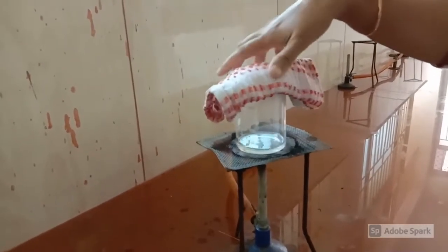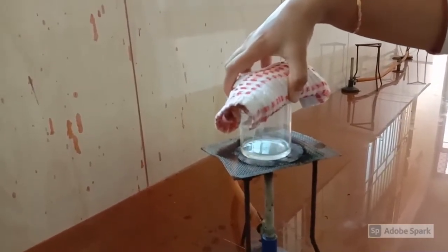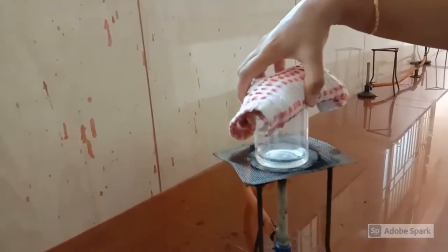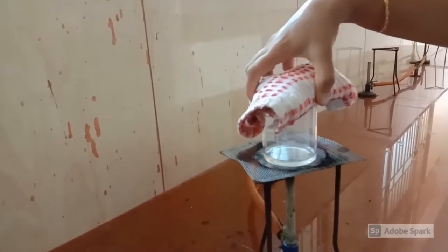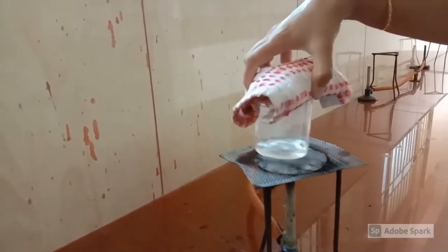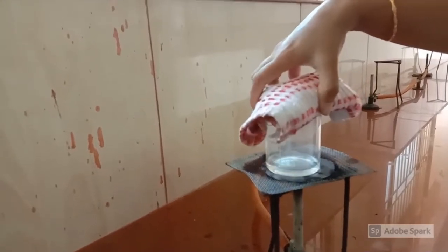The purpose of covering the beaker with a towel is to avoid contamination. The heating can be stopped when the color of the solution becomes light pink.